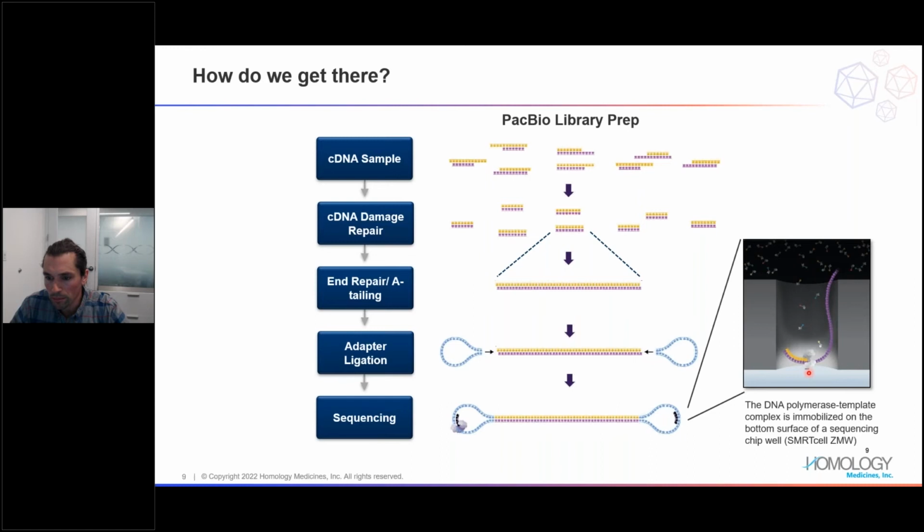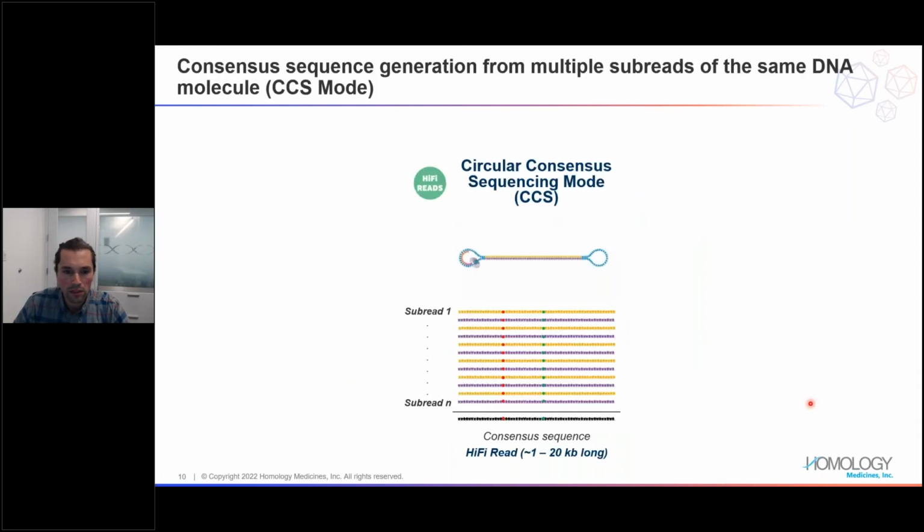And so you have this polymerase bound down there, you have integration of your fluorescent nucleotides, and you have this laser shooting up at it, and so you can see what integrates and when. And as Don was mentioning, you can really capture that signature. And so you can see over here in this animation the polymerase going around this circular molecule that you've created with your SMRTbells, and then you have your payload in here.